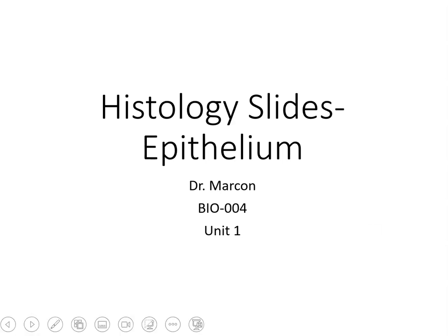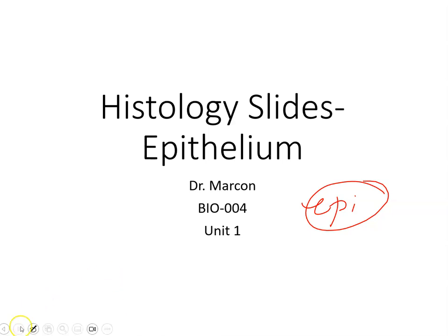When we are going over epithelium or when you are labeling epithelium for your practical exam, remember you can use the abbreviation EPI, EPI for epithelium. Okay, so let's take a look at our different types of epithelium with the slides that I've provided for you.